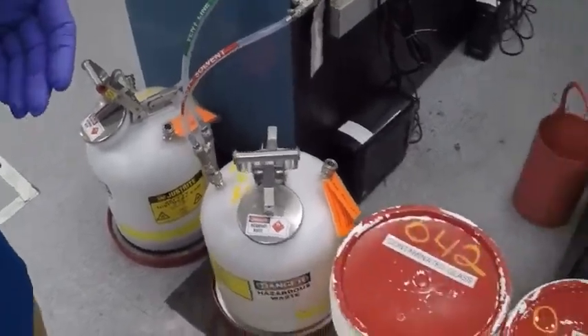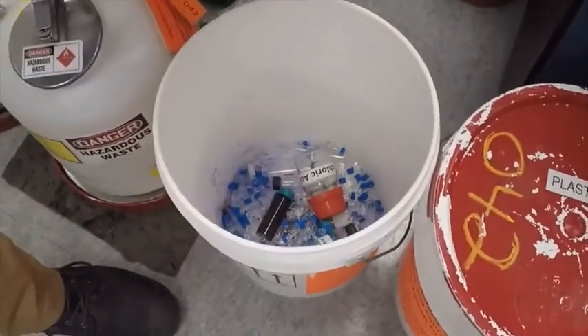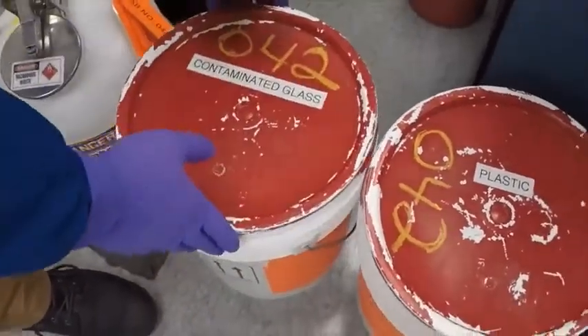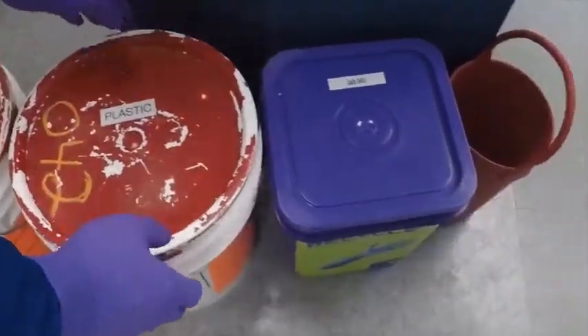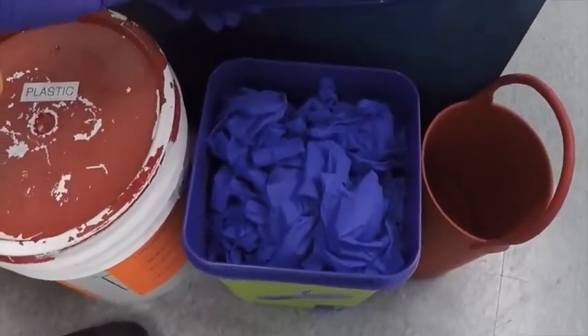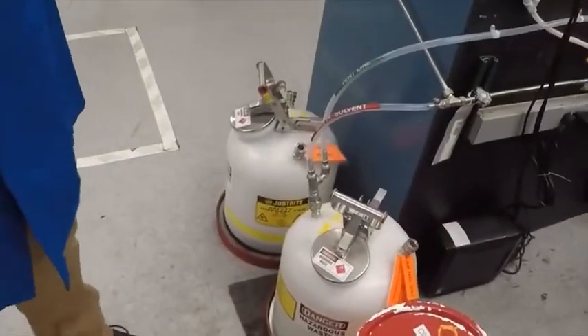Other typical lab wastes include contaminated glassware — vials and gross bottles — contaminated plastics, pipette tips, well plates, and gloves, each with their own designated receptacle. All waste streams need to be kept separate and disposed of properly. Your waste manager or EH&S manager will work with a disposal company to ensure all waste is disposed of per the proper regulations for the size of your lab. Please check with your EH&S manager for proper disposal of any materials you have in your lab.